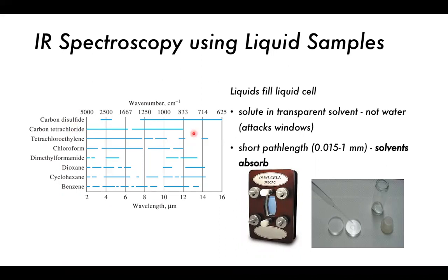And again, of course, that means our liquid sample should also not interact with salts. So there's a lot to consider whenever you're doing FTIR spectroscopy of this type, which is ultimately why a new technique was developed called ATR, which we will see shortly, which improves the chances and makes everything a little bit easier to do.